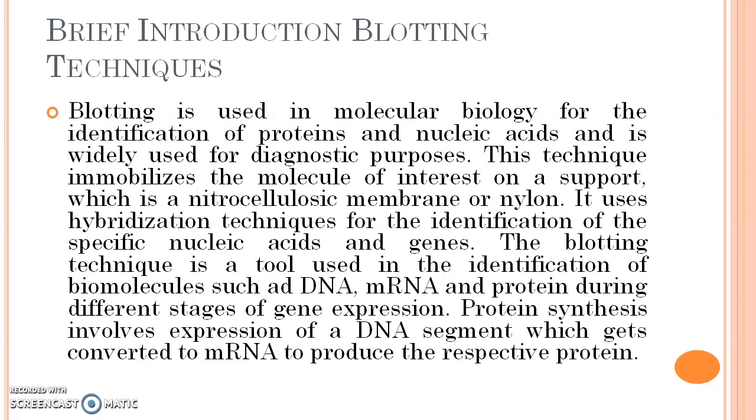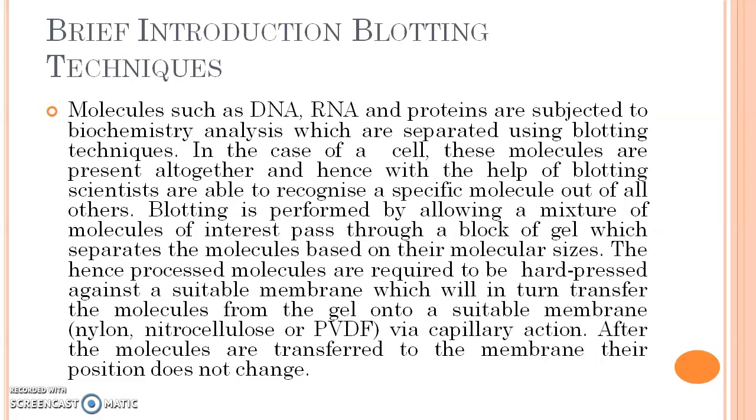Protein synthesis involves expression of a DNA segment which gets converted to mRNA to produce the respective protein. Molecules such as DNA, RNA, and proteins are subjected to biochemical analysis, and are separated using blotting techniques. In a cell, these molecules are present altogether, and hence with the help of blotting, scientists are able to recognize a specific molecule out of all others.